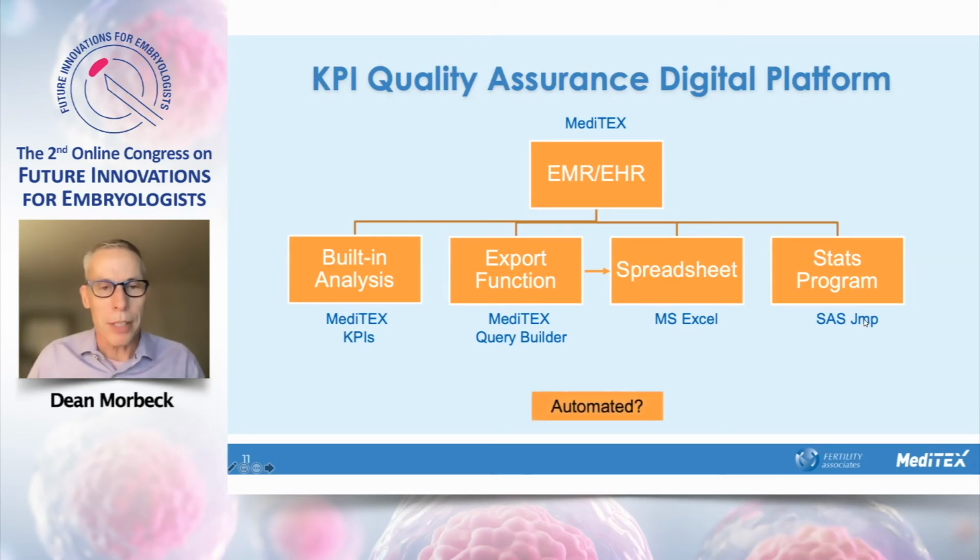The big thing about this, really, we should be asking, and especially in this conference when we're talking about future innovations, is when can this all be automated? That actually the data is put in. Some of the data hopefully is put in automatically from, say, time-lapse incubators that automatically put the information into the EMR. And then all of this data that we normally export could be generated, and we could see a dashboard and just have all that data analyzed with machine learning to give us really good metrics on how things are going. And that's where we're headed. We're not there yet.